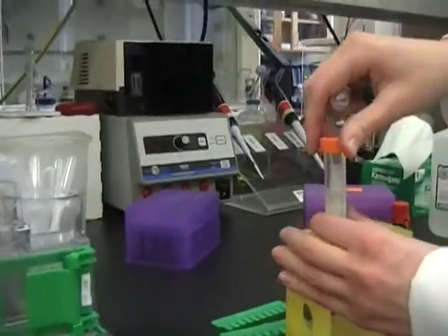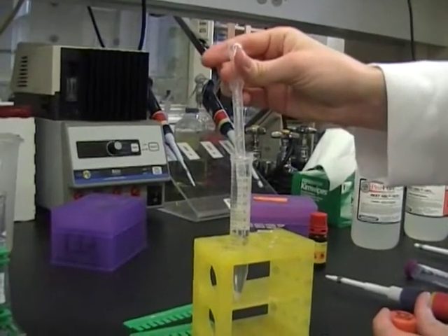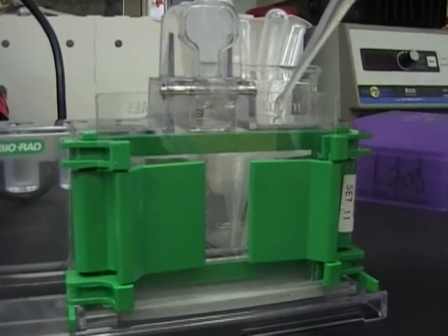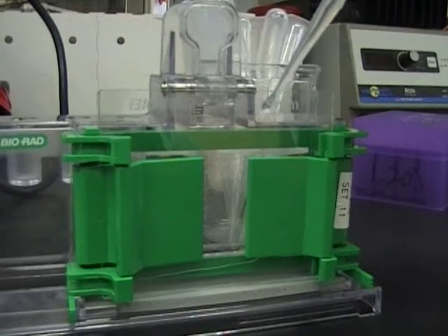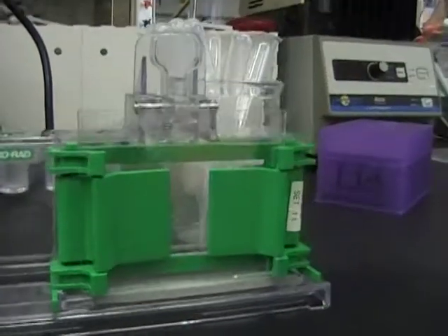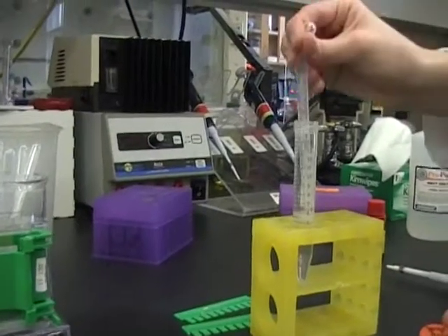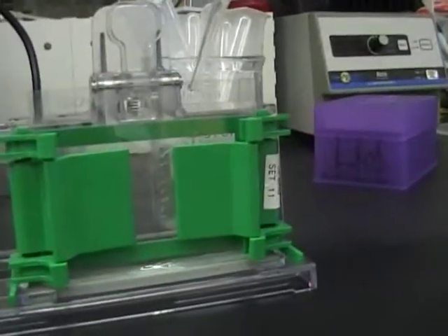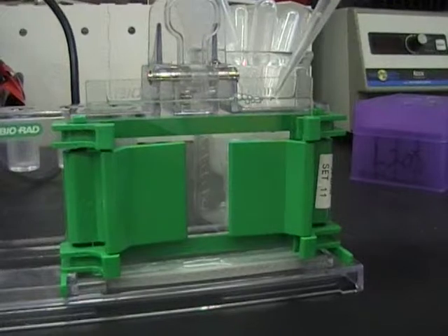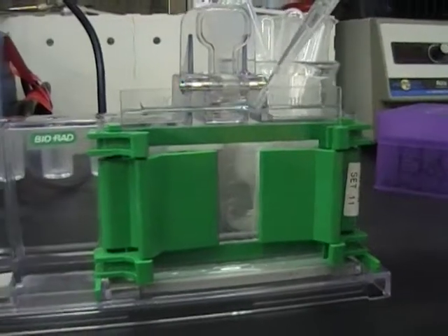Once your solution is ready, you can go ahead and cast your gel. Use a transfer pipette. Put the transfer pipette up to the glass plate so the solution just runs between the two glass layers. Go to just slightly over the top, and suck out any air bubbles that remain.